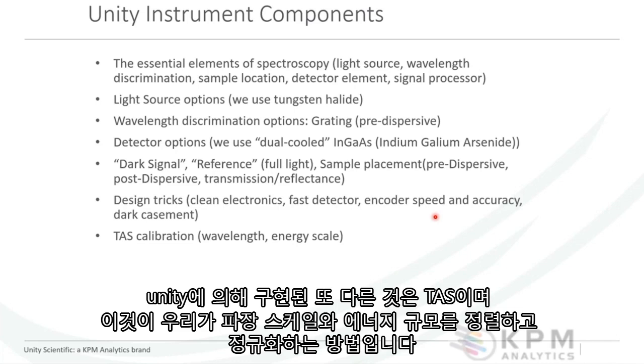recently. Another one that's been implemented by Unity is TAS, and this is a way that we align and normalize the wavelength scale and the energy scale.